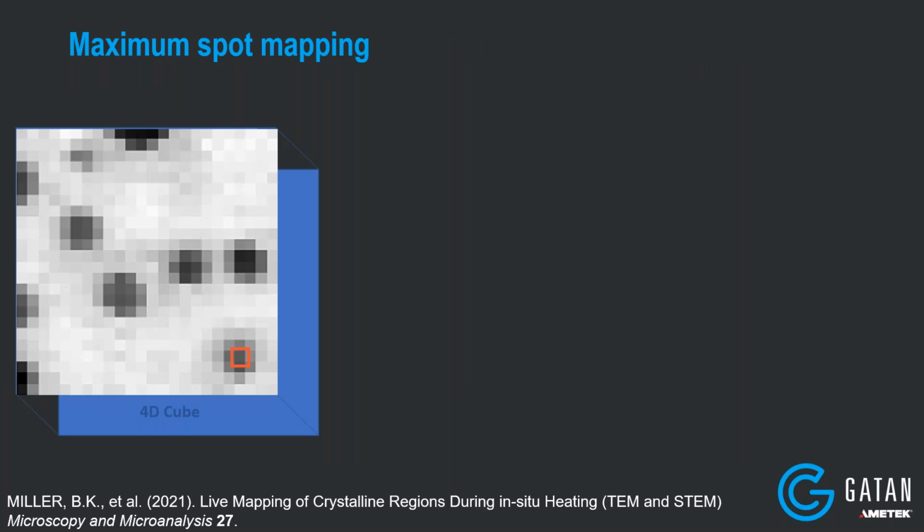So the maximum spot mapping technique is something that I made up a couple years ago. I had never seen this done, but I thought this would be a good way to very quickly and easily process 4D STEM data, and specifically an entire series, an entire in situ series of 4D STEM data.